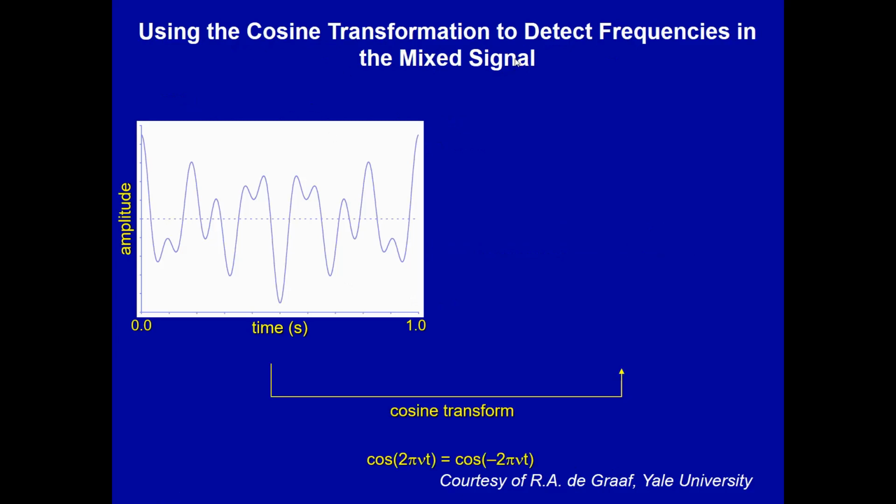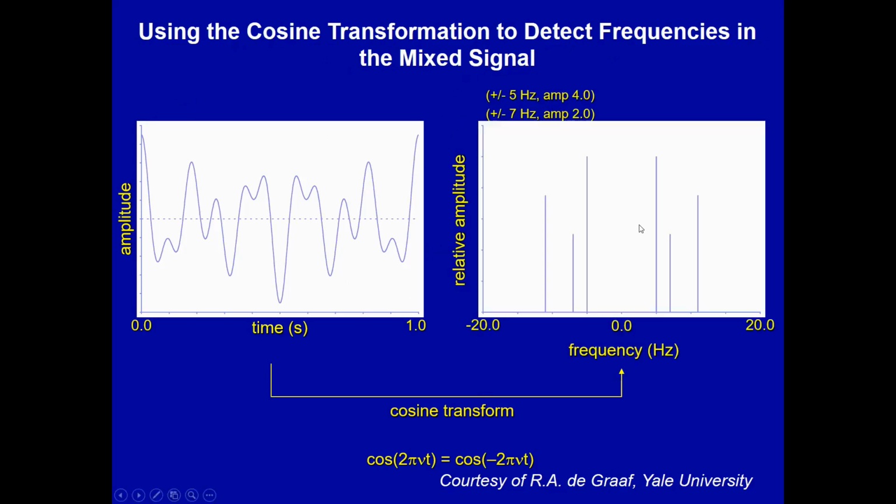We do this cosine transform. And here we are. We have multiple frequencies that comprise the signal. And see that there are 6 peaks here. Something you may notice that seems a little odd is that what's on the right is a mirror image of what's on the left. And that's going to introduce kind of a strange concept.